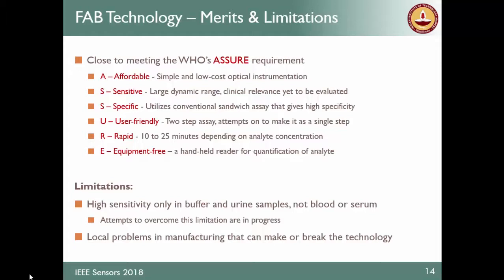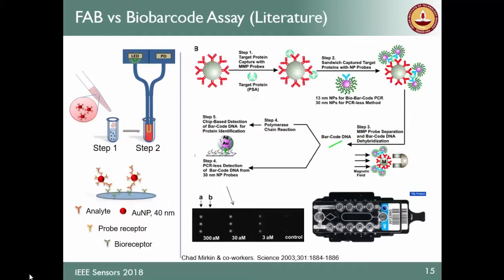However, you see that the silica fibers are 200 micron. In between, we tried to compare ourselves with one paper from 15 years ago.